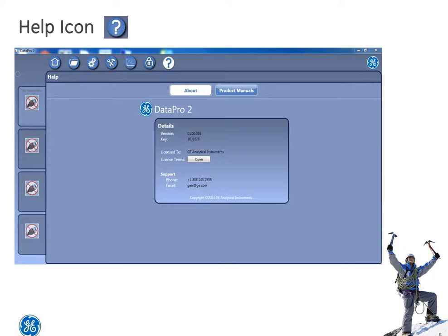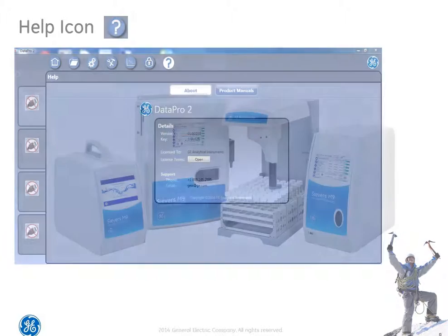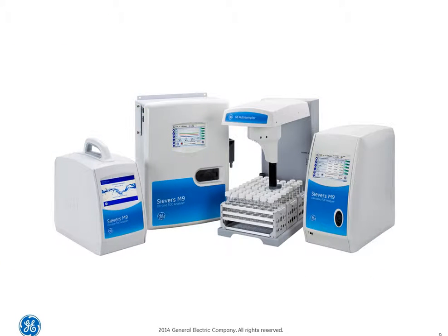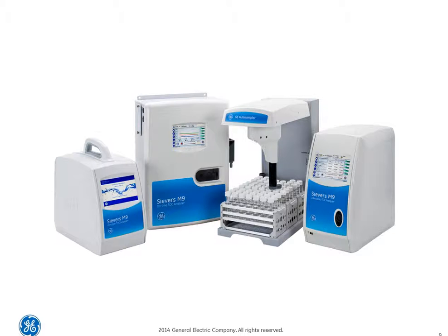And finally, the Help icon provides general system information and the electronic documentation. That's about it on DataPro2 icons. Hopefully you found this helpful, and be sure to check out our other info videos.